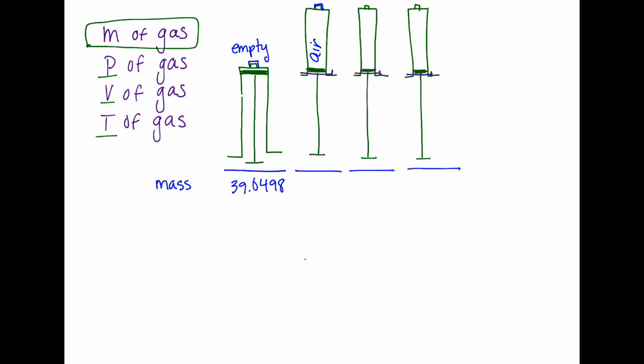I want to skip to the last one real quick. This one I filled with an unknown gas, and it has my nail in there, so I know the volume is 60 milliliters, and I also put the cap on.